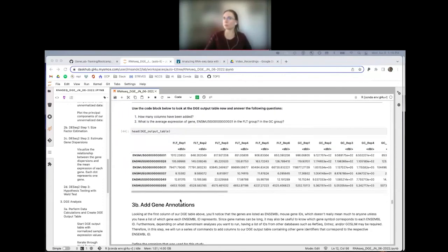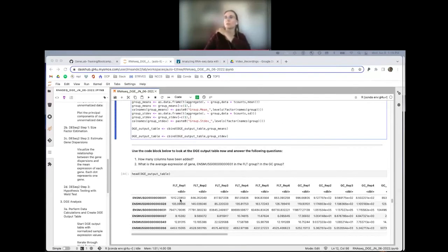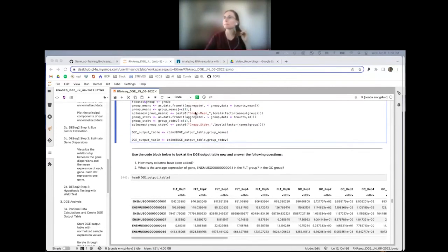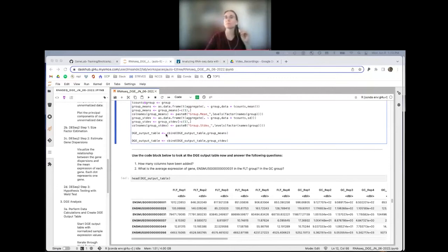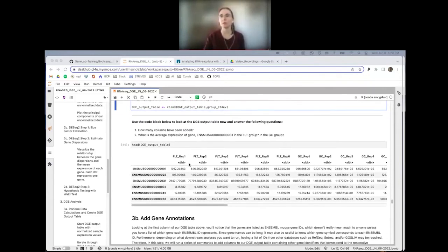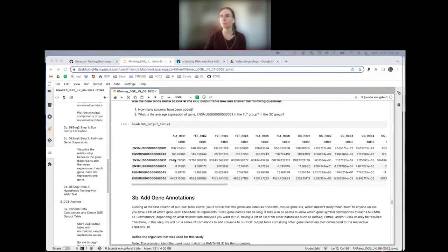All right. So Mark, when you restart, as you know, you're going to have to run all of the cells all the way down to the 3B header, all right? Great, okay. So I'm going to slowly move on, and if anybody else is running into issues with the kernel, let me know. Okay.